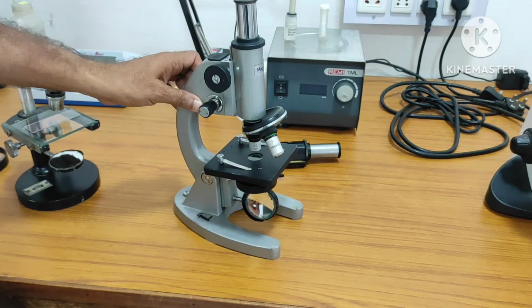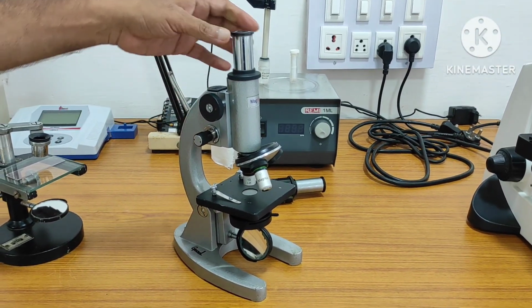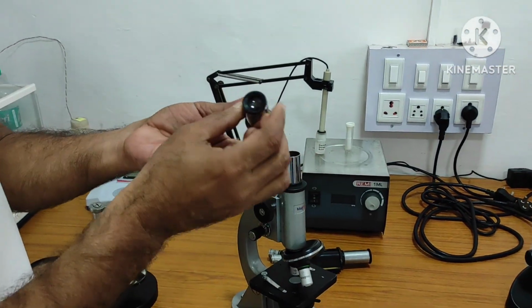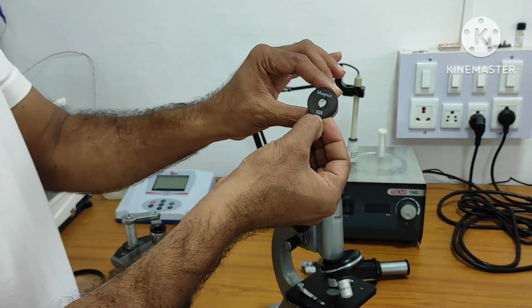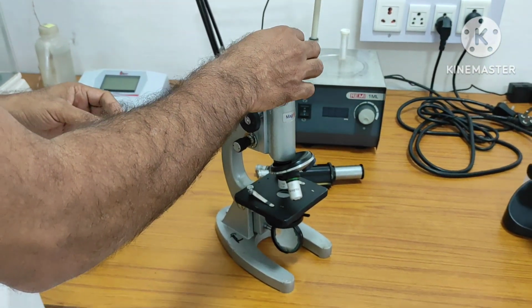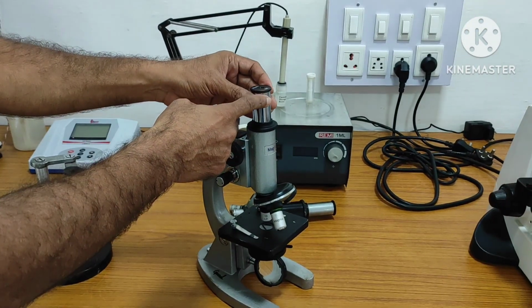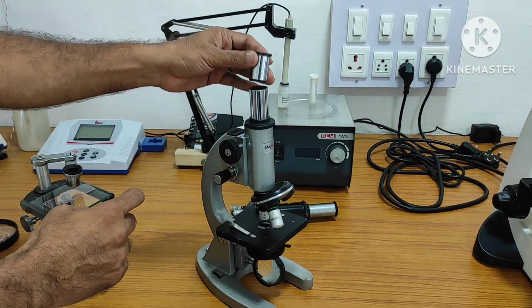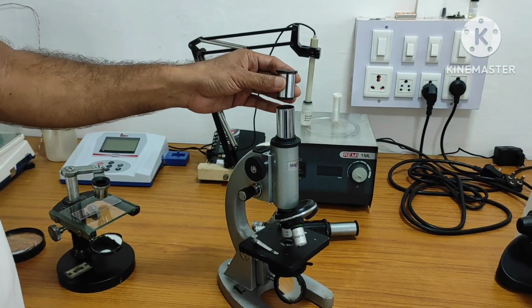Friends, this is an example of a compound microscope. Why is it called compound? Because two types of lenses are used here. This is called the eyepiece, which has one lens, and its power here is 10x. It is present on a tube called the lens tube. We put our eye here to observe the specimen, which is why it is also called the eyepiece. We can change it. Now we have 10x, but we can change it to 20x also.